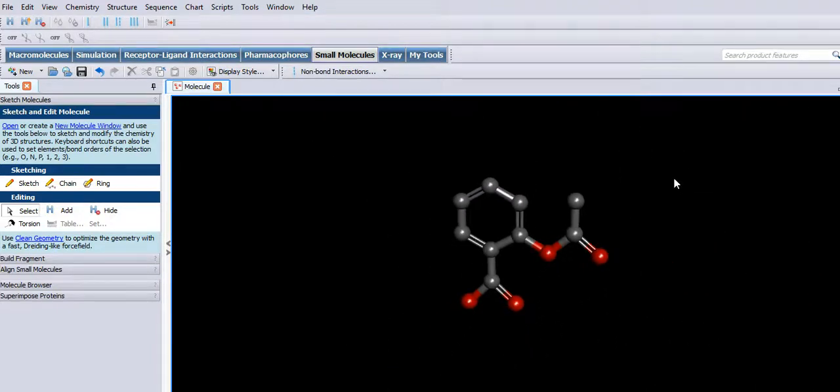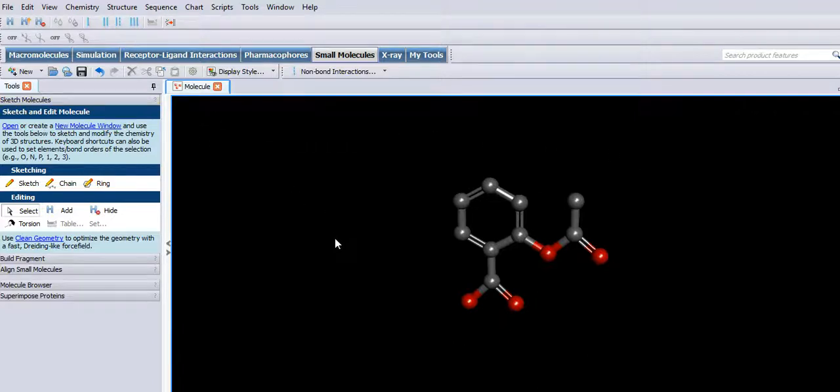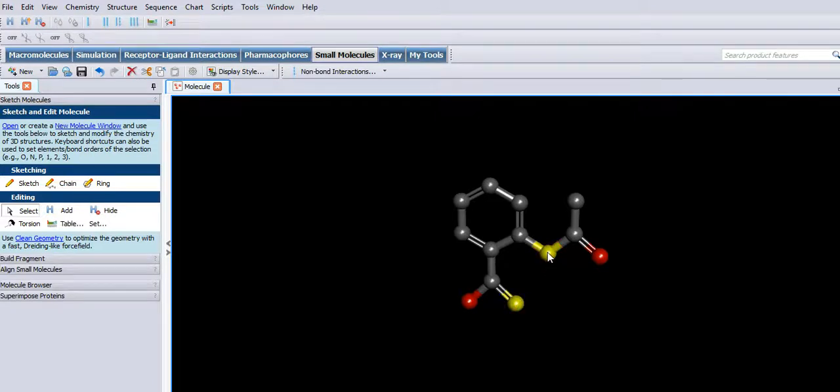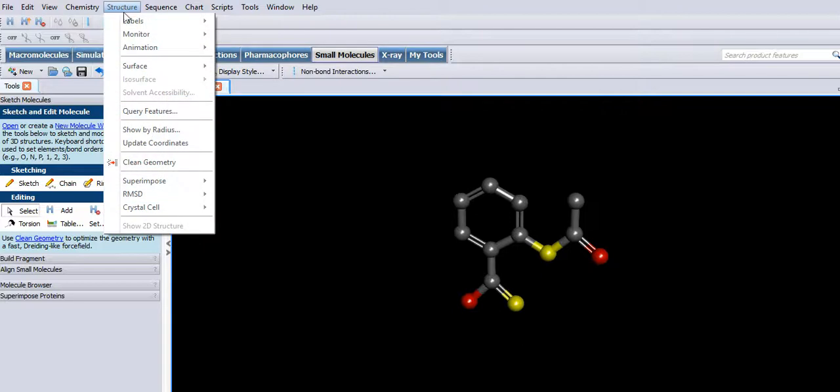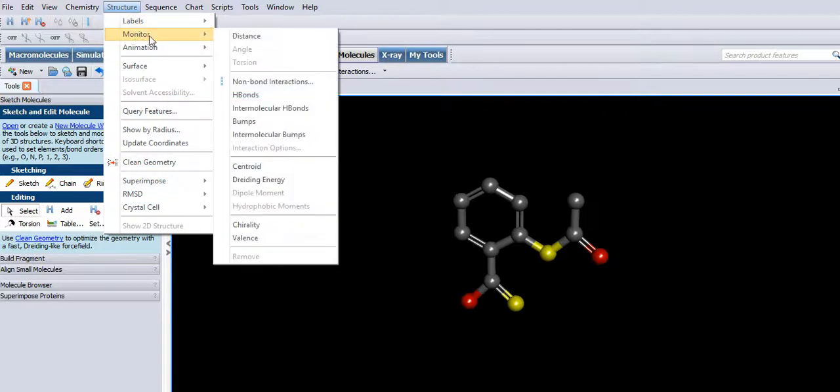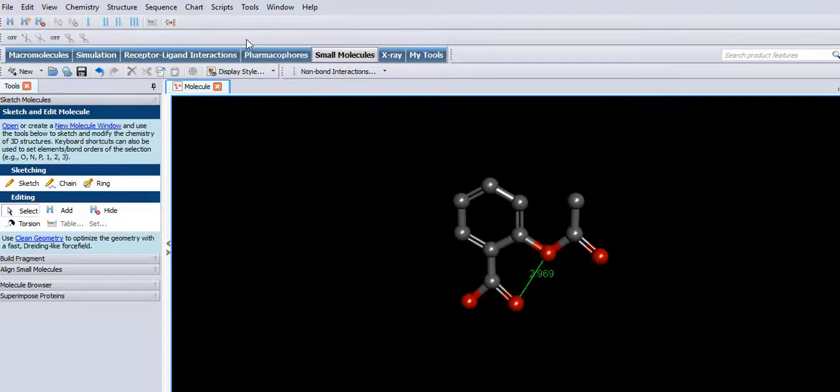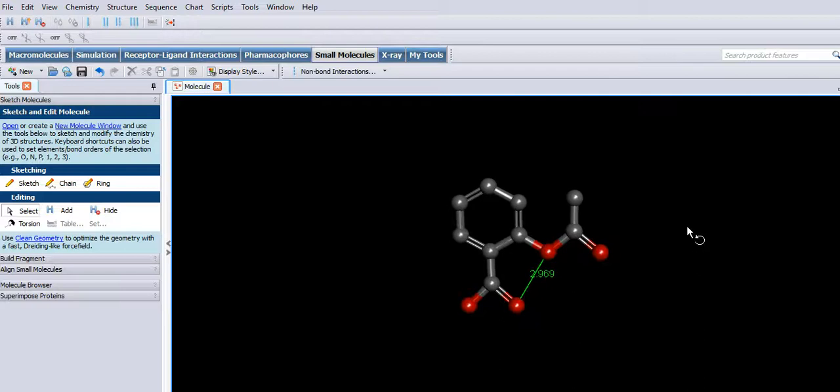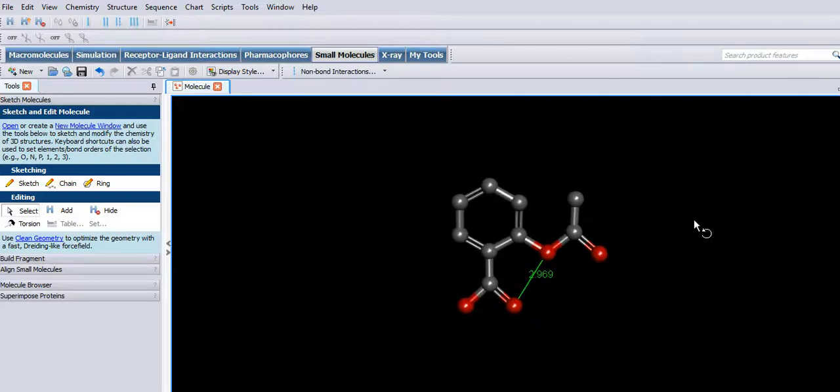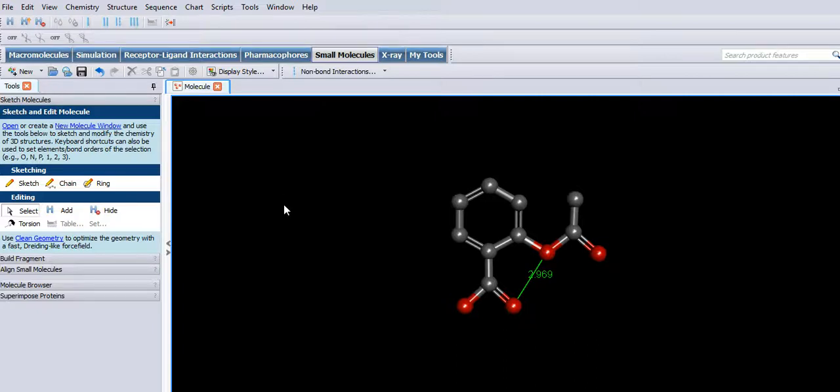Okay, so let's measure a couple of distances. Holding down shift again, let's just highlight those two and go to structure monitor. Is that 2.969 angstrom? Okay.